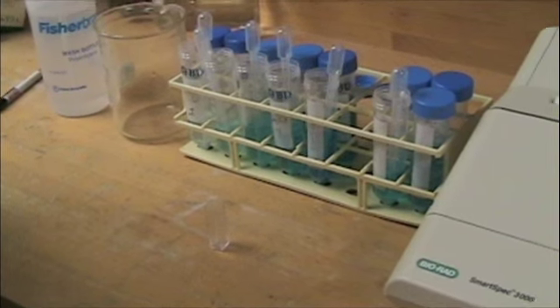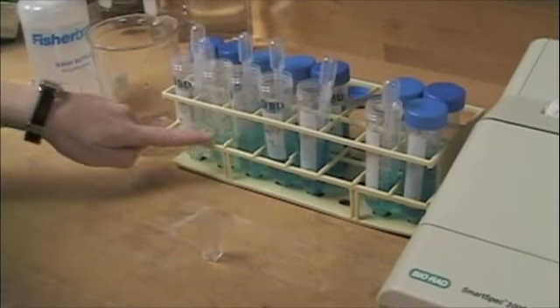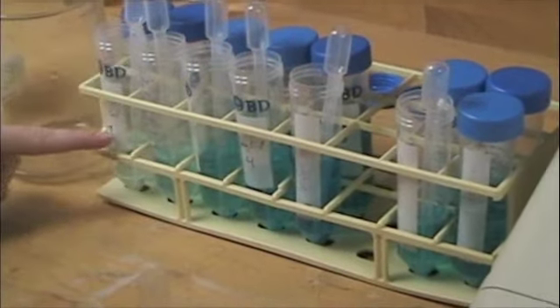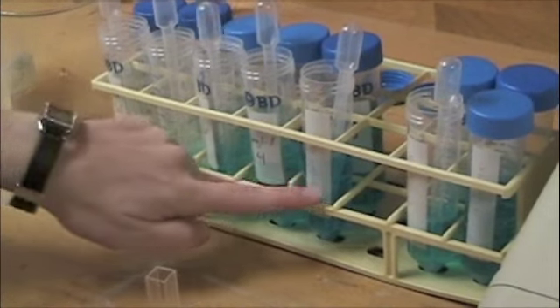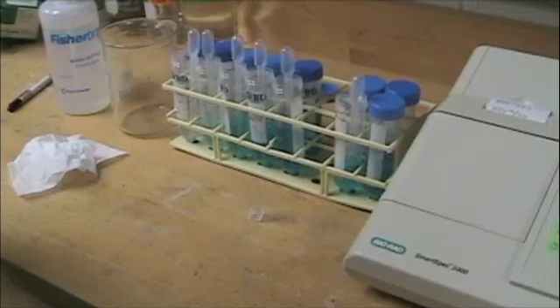We have blanked the spectrophotometer. We're ready to read our samples. So you can see that the color of the samples go from light to dark. So the first one is the most dilute, the last one is the most concentrated.